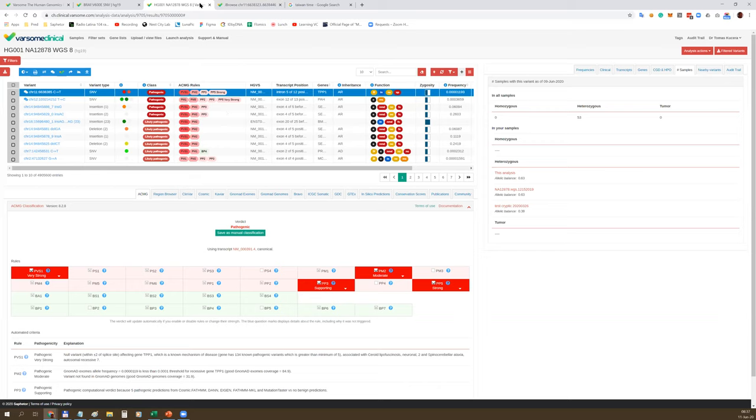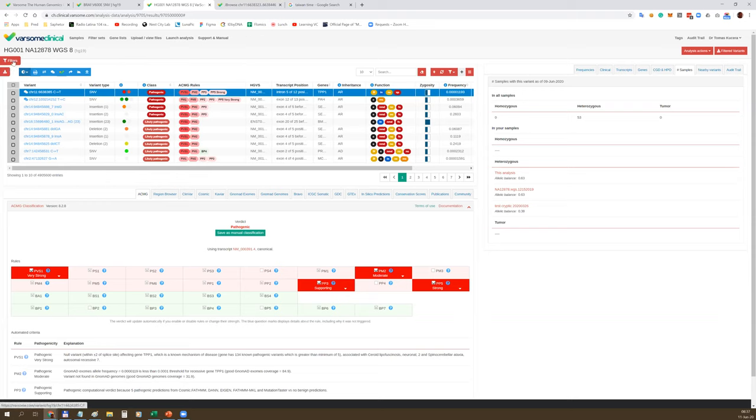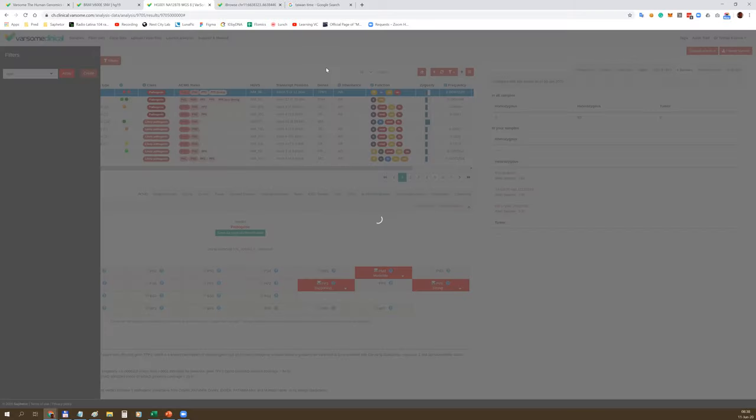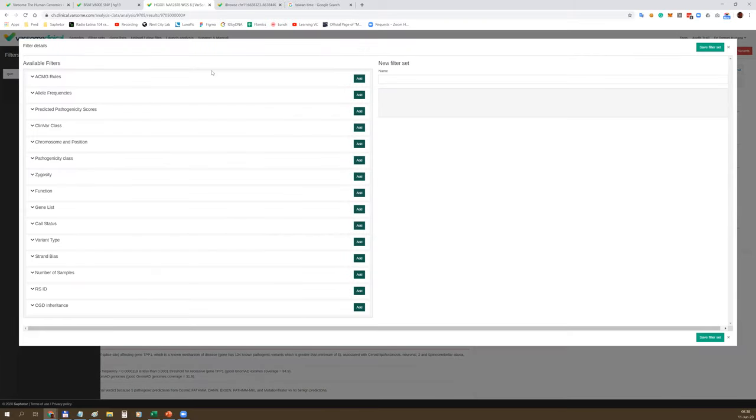The other thing is sample cross-referencing. We link all your samples together on the variant level. For example, this particular variant has been found so far three times in a heterozygous form - in this analysis, in another whole genome sample, and in another sample called Test Cryptic. This allows you to compare your past cases with current cases, compare allelic balances, patient phenotypes, and over time, together with custom classifications, increase the diagnostic yield for your patients. Now, filters.